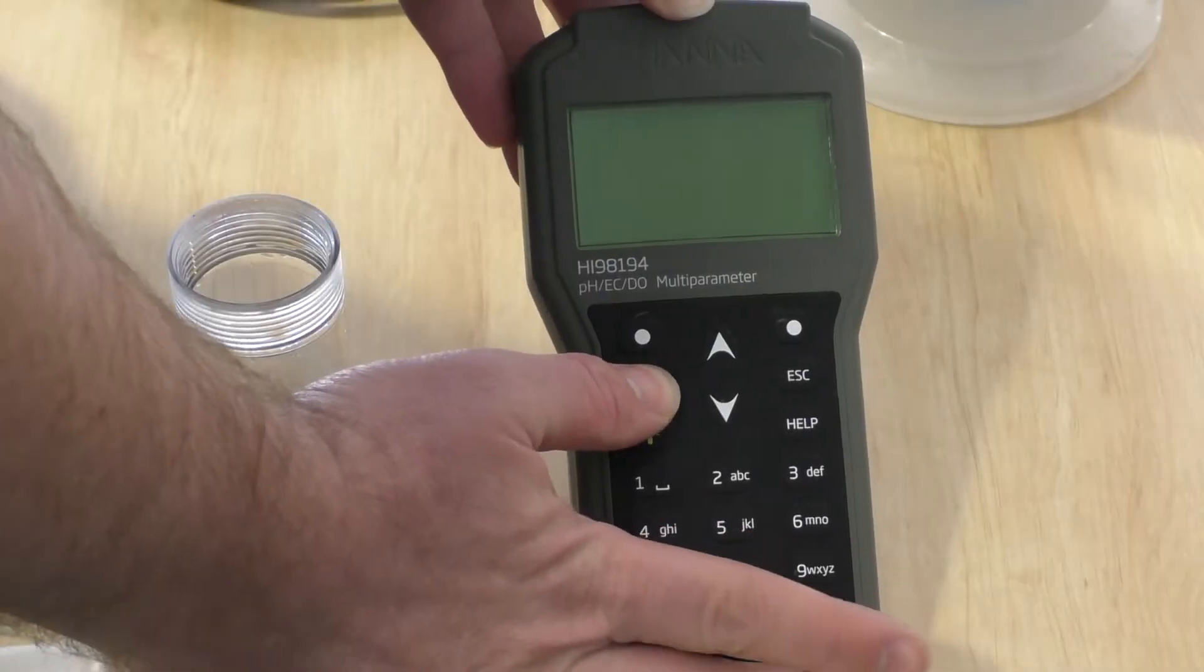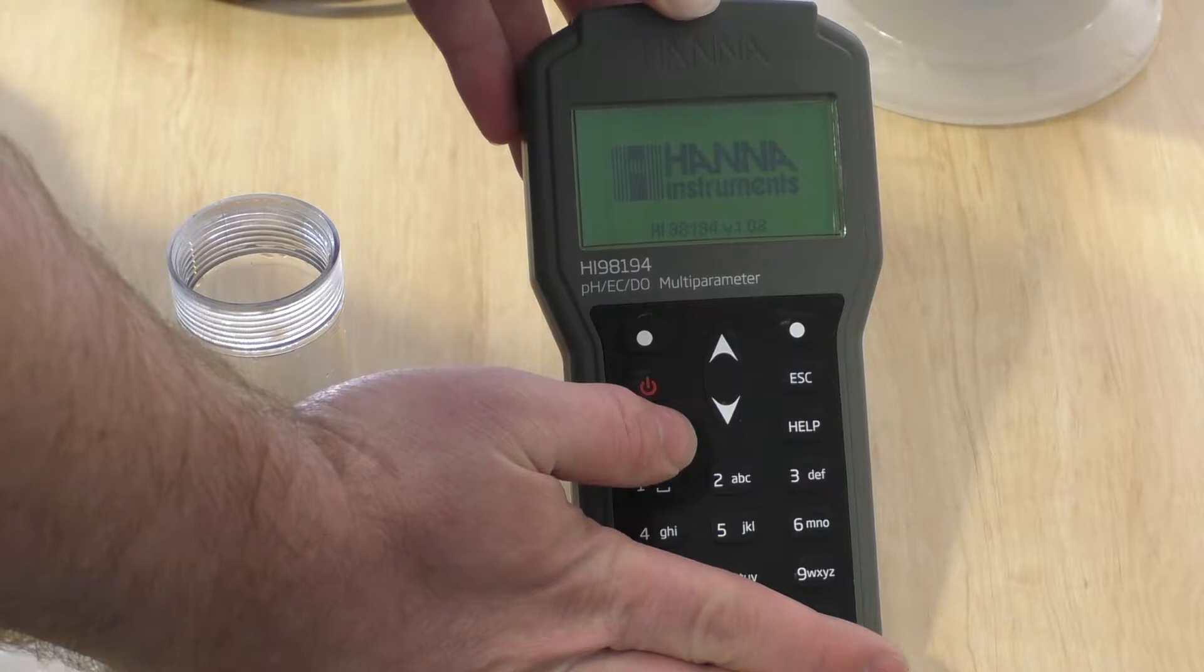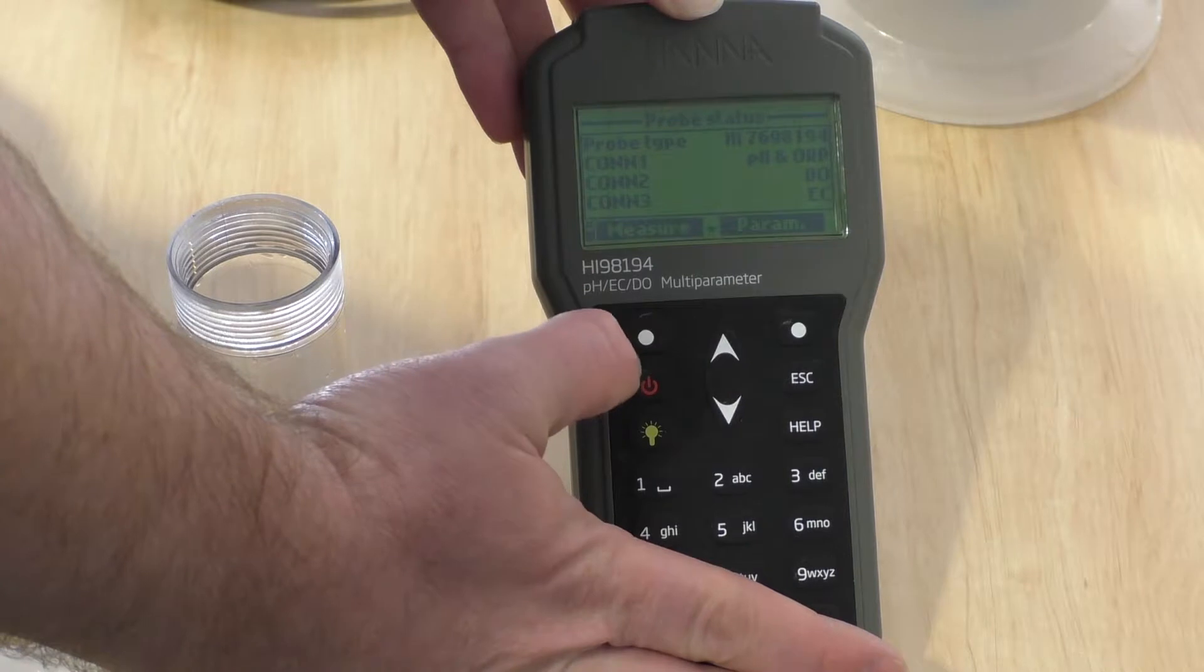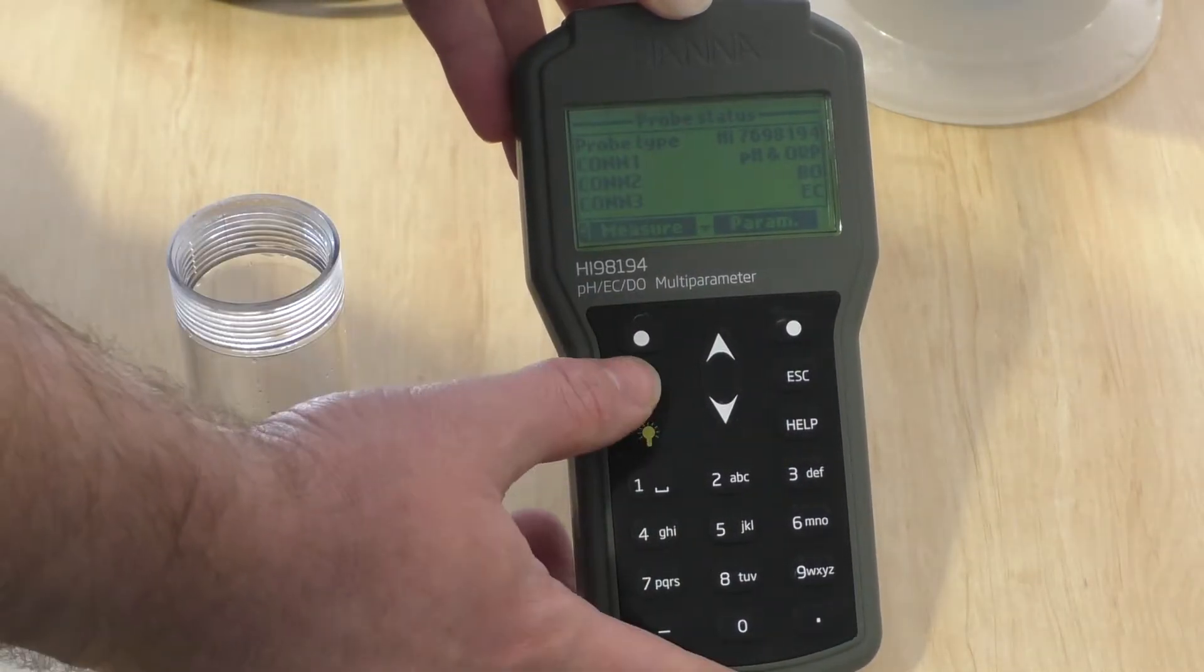So just switching the instrument on, hold the power button, showing that its sensors are all there and accounted for.